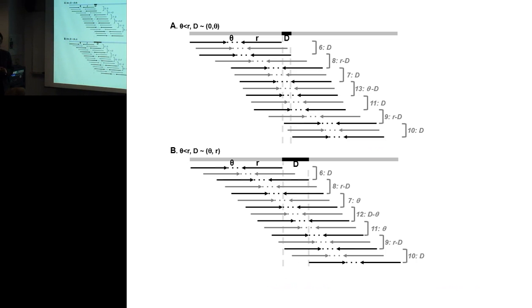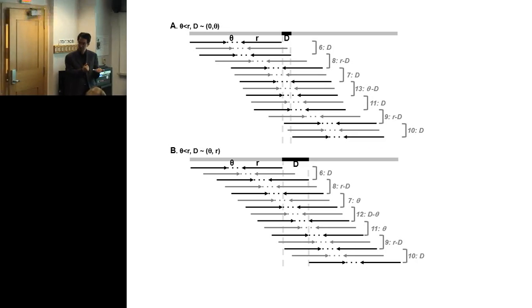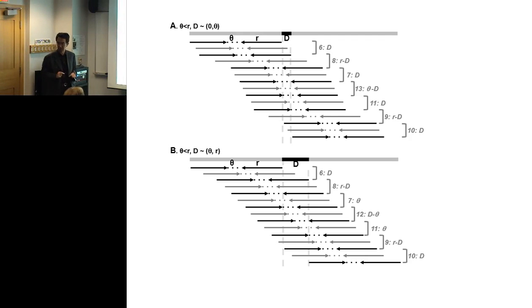What we were talking about would be the 8 and 9 types, where you have the transversal read, where you got the other end, which does actually get you to the right locus. So you could check for consistency. So 8 and 9 are the most informative ones when the situation is favorable. But when read depth is limited, you may only have one or two reads of that type. So it's a trade-off. Do you use less perfect, less informative ones, but more numerous, or do you use a few of these most informative read types?